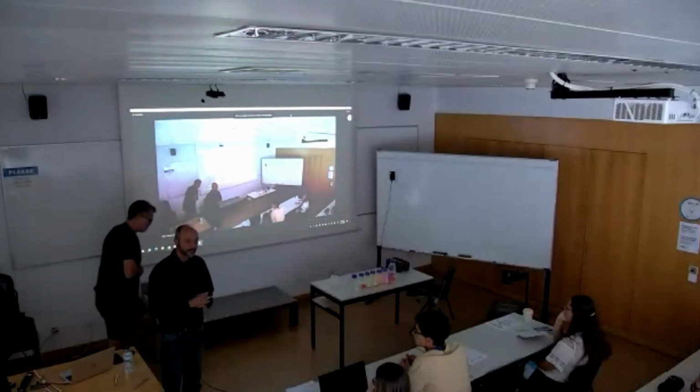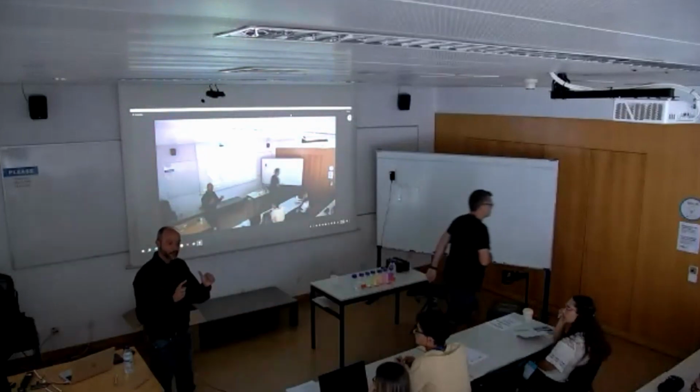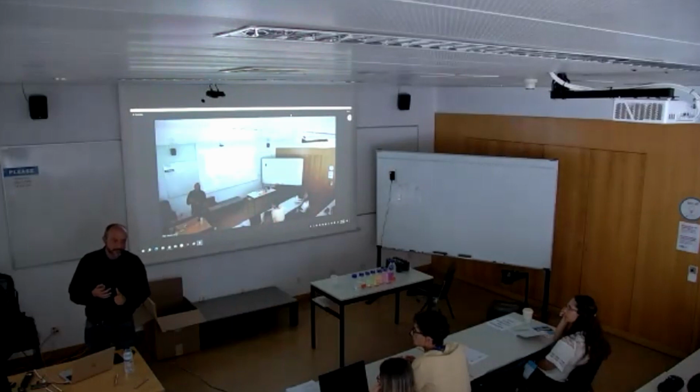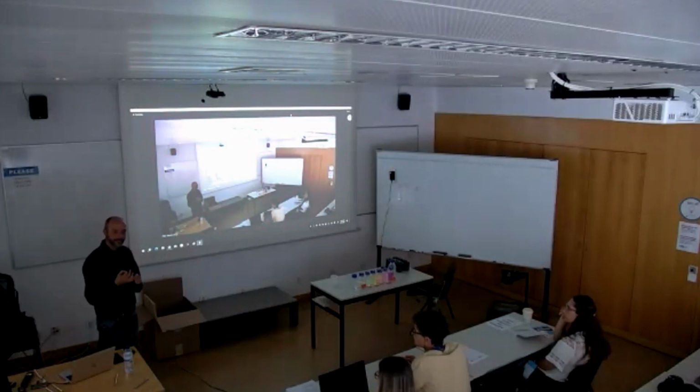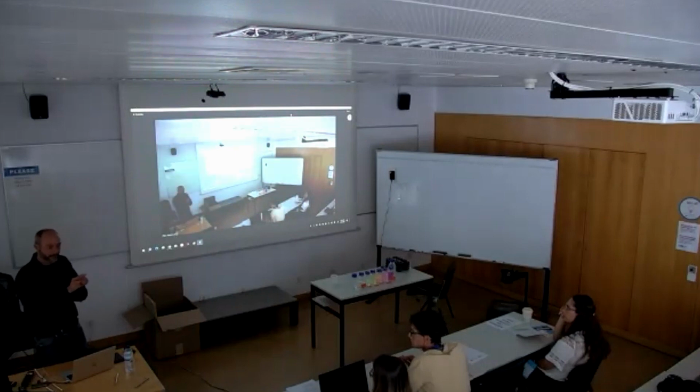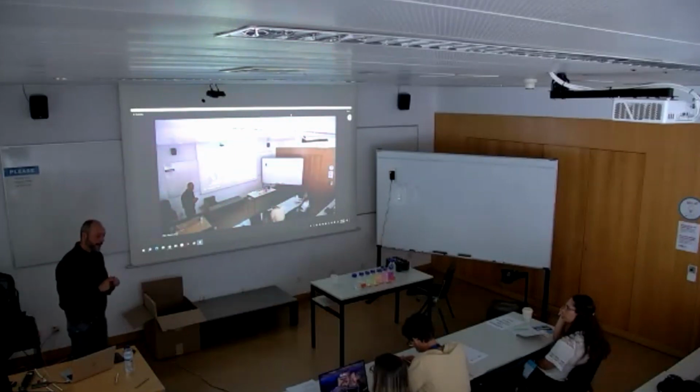But then it's clear that basically the image is due to interference, because Abbe with his experiments demonstrated that to build up the resulting image, you need at least two rays of light that could interfere together. You cannot do it with one. If you have just one ray of light, you would have no interference, right? So you need at least two waves, two rays, to have interference. And that's clear if you think.